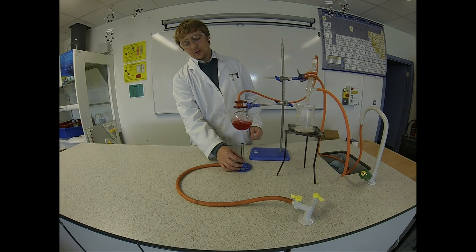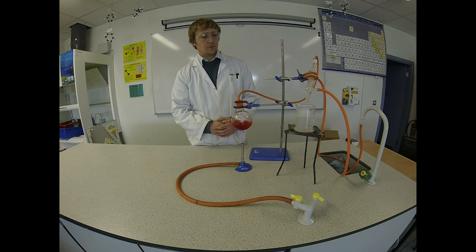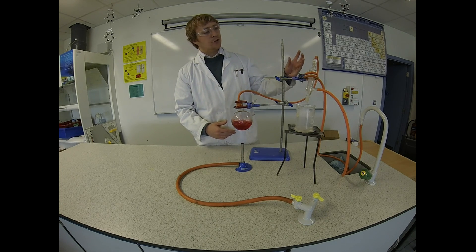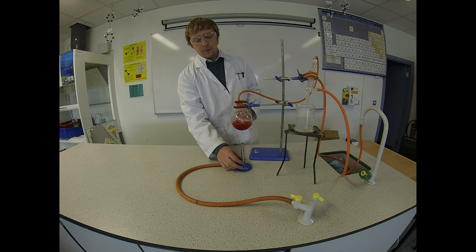I'm just going to turn the heat down a slight bit — we don't want it to boil too vigorously. If you boil the water too fast, the steam will shoot through the Leibig condenser too quickly and it won't have time to condense back down into water.